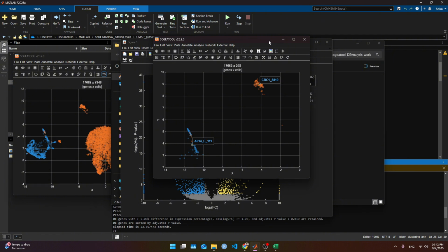It's complicated because you need knowledge about the sample and the cell type to get some insights from that.